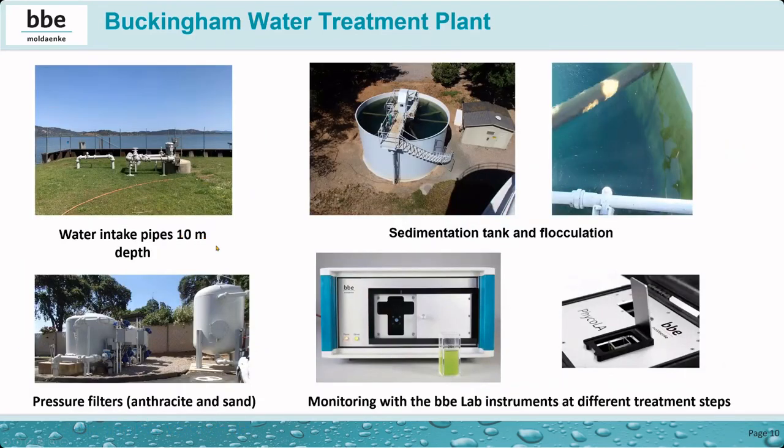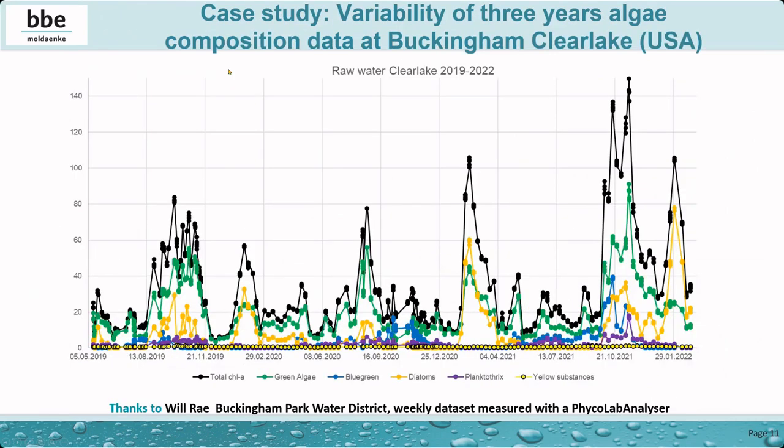Yeah, they have an intake pipe of 10 meters, then typical treatment steps: sedimentation and flocculation, then pressure filter, and they monitor with our lab instrument the content at the different treatment steps. Some samples as a case study of approximately 3 years of algae in Buckingham Park.